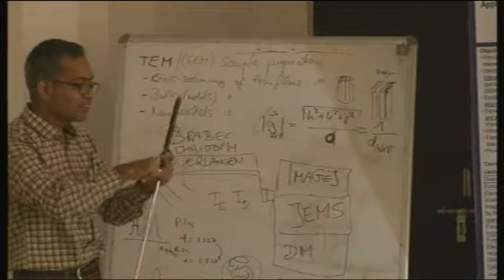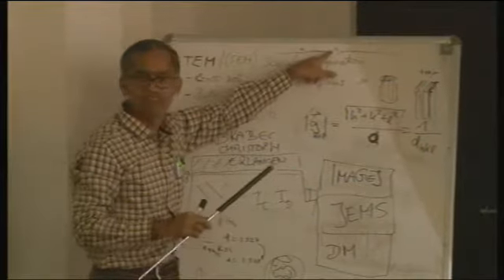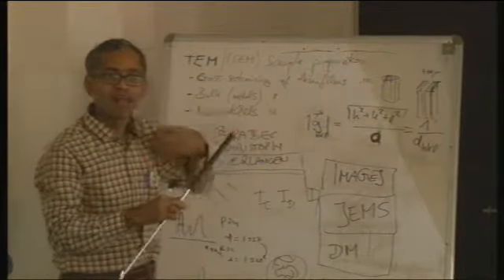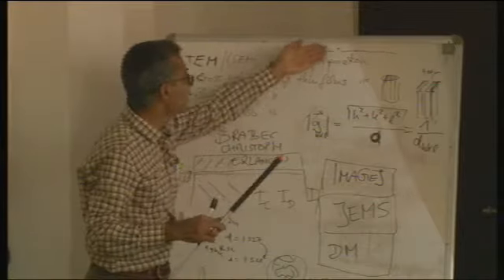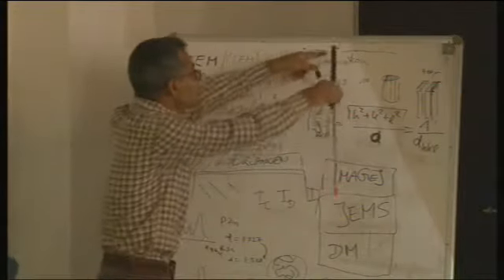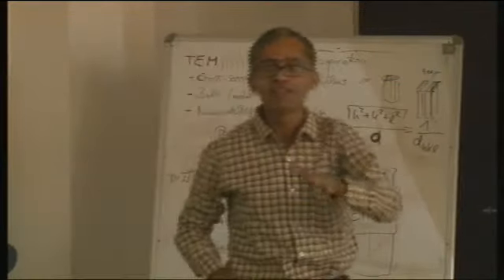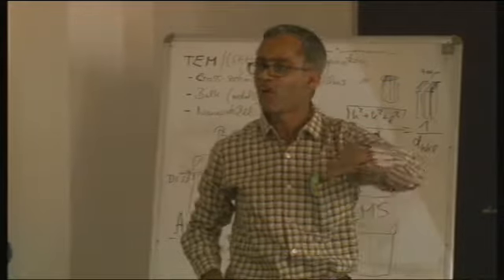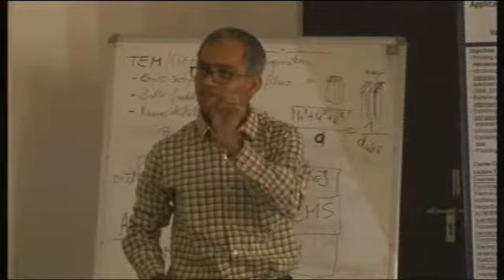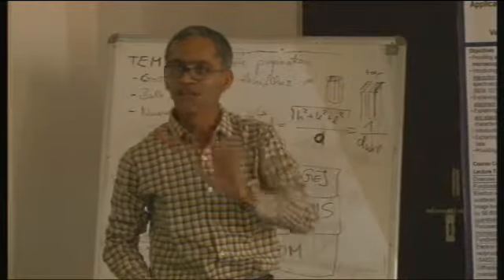This beam has become most condensed at the diffraction spot, and here I am most efficient in selecting this one and blocking the others. After that, it will get enlarged, and in the first intermediate image plane it will form a perfectly alright image. But I have managed to select only the zeroth beam. Correct? Is this understood?